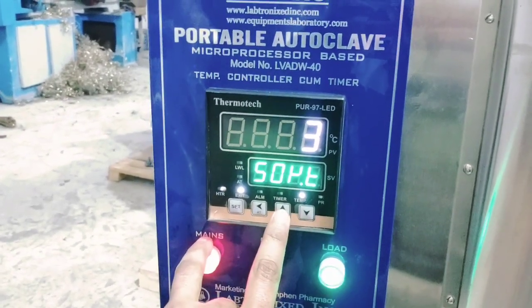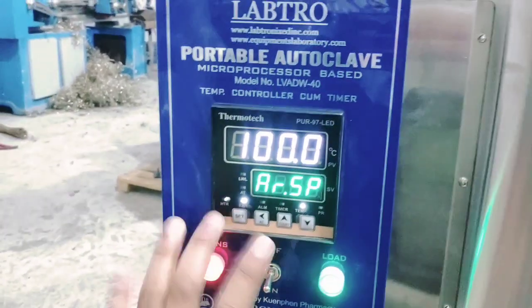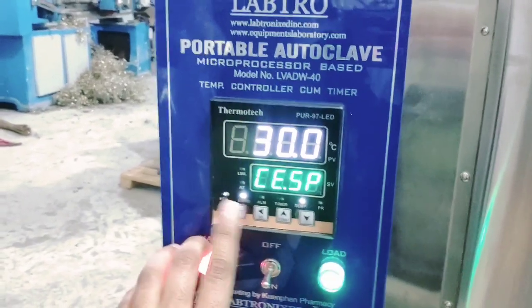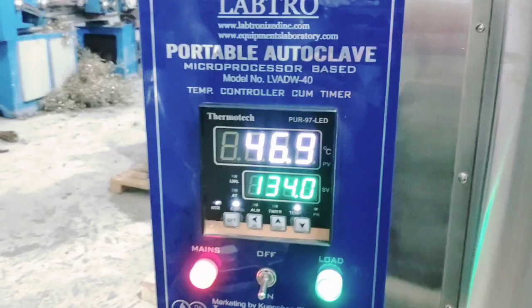Now we need a sterilizing timing of 5 minutes. Okay, then set, then set, then set. Okay?